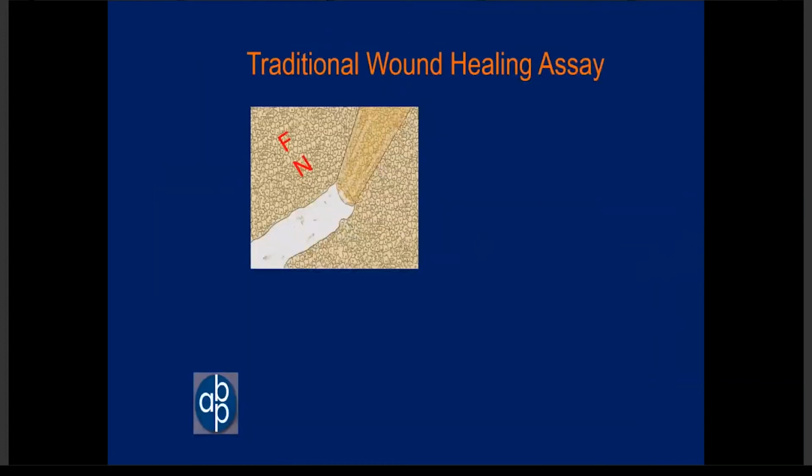There's another aspect that's a little different about the ECIS wound healing assay than the more traditional scrape wound. For example, suppose that you had put down fibronectin on your cell substrate and grown the cells to confluence before scraping through the cell layer to do the migration assay.